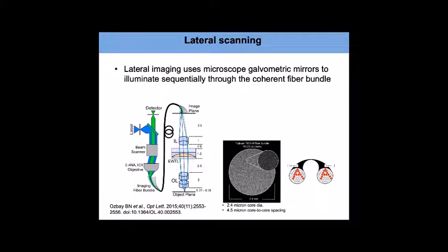Okay, and so this is sort of the full experimental setup of this design. What I'm showing over here is your laser scanning microscope, and that's coupling light through that objective adapter into this imaging fiber bundle, which relays that light onto the sample, and you use that tunable lens to adjust the depth.